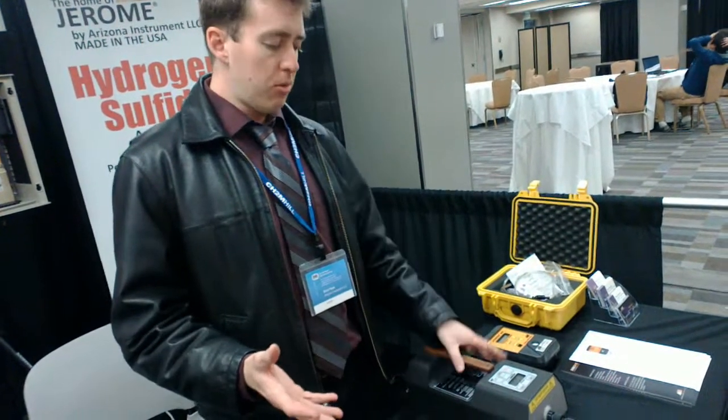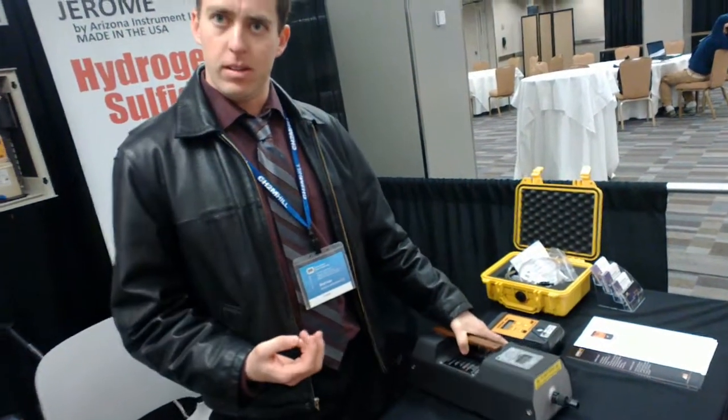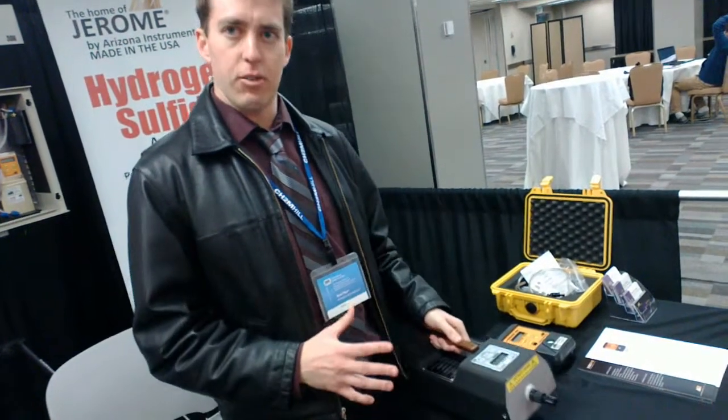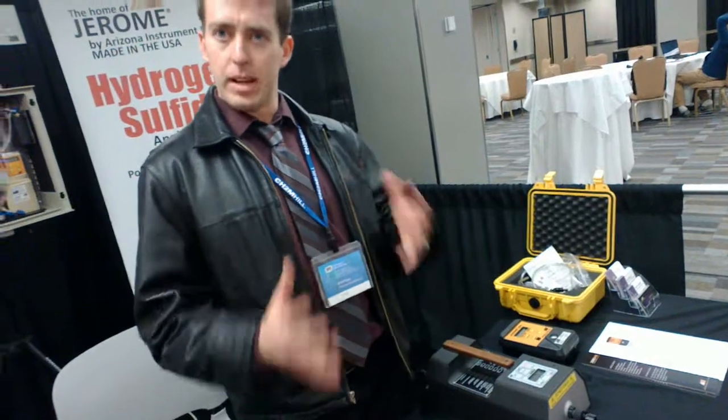That's also the reason why these instruments are so big — because they have to pull the air into it. It's just part of the trade-off with the equipment. You get very low readings, but they have to be about this size to have all the components inside to make it operate correctly.